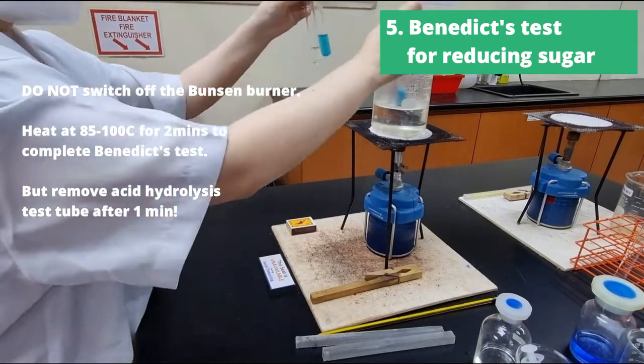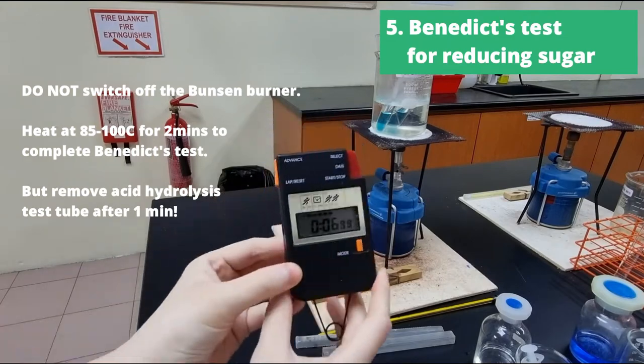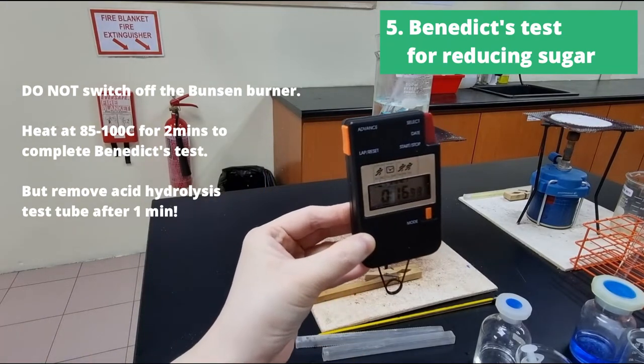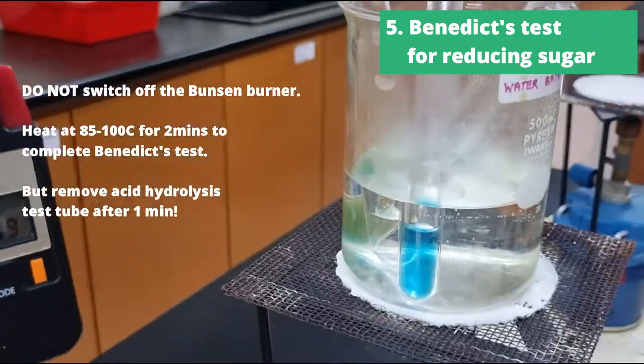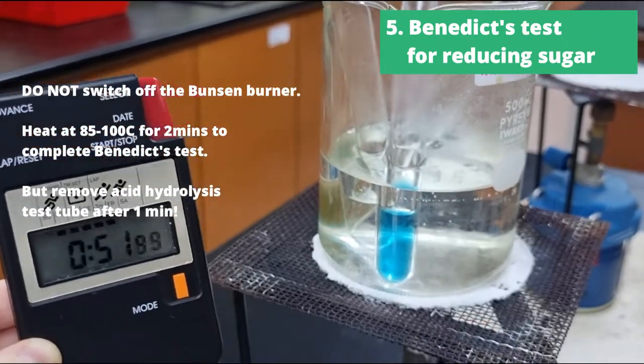Make sure the water bath is between 85 and 100 degrees Celsius. For the first two test tubes, we can heat for two minutes, but for the acid hydrolysis test tube, we're going to remove it after one minute.